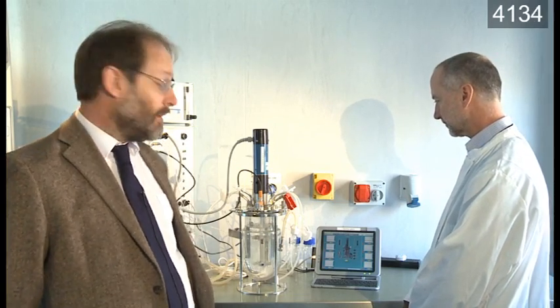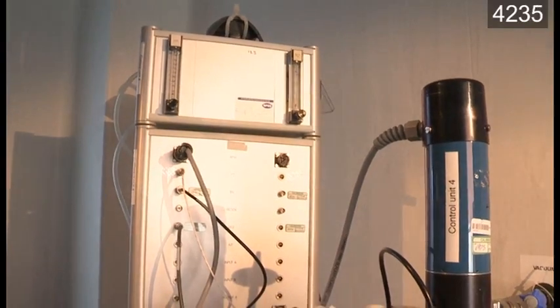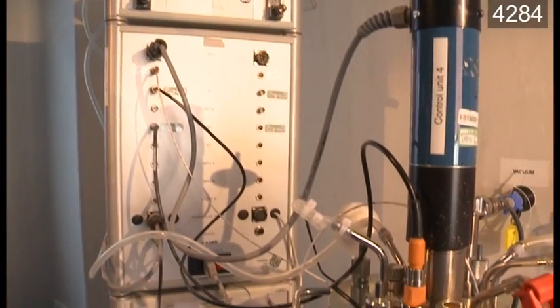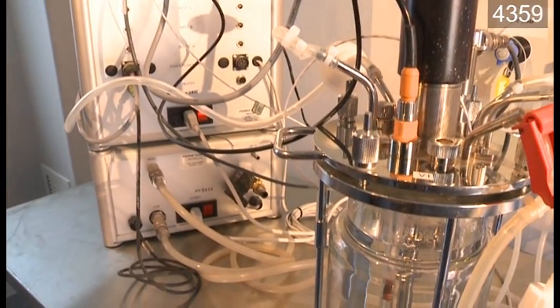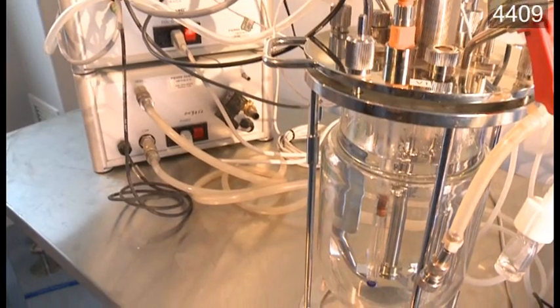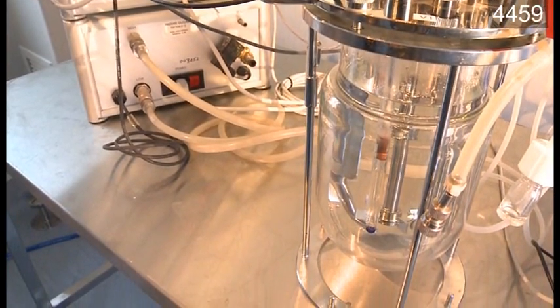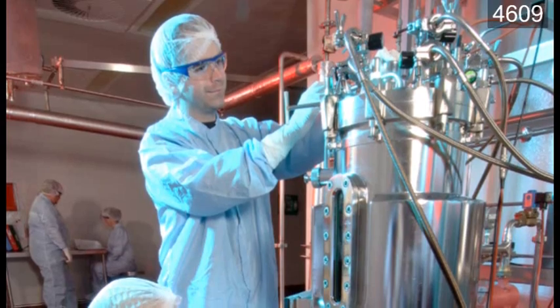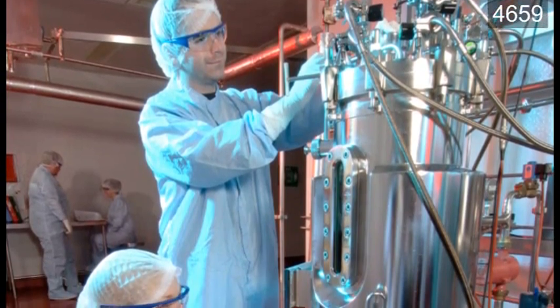In terms of process validation, what we would be looking at at this scale is looking at the critical control parameters for the fermentation. This is extremely helpful when we move through the process as we would tend to start the validation process during scale-up and look eventually within a pharmaceutical facility to do three clearly defined process validation runs.